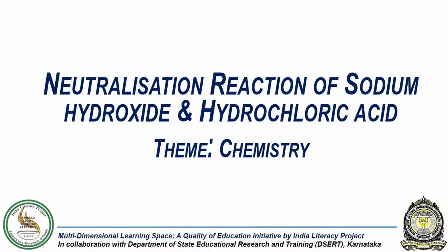In this experiment, we are going to demonstrate the neutralization reaction of sodium hydroxide and hydrochloric acid using phenolphthalein as the indicator.